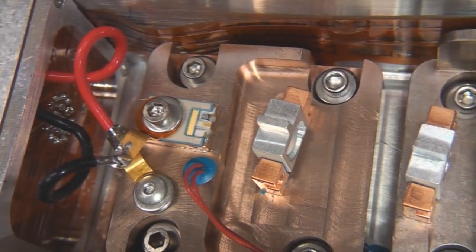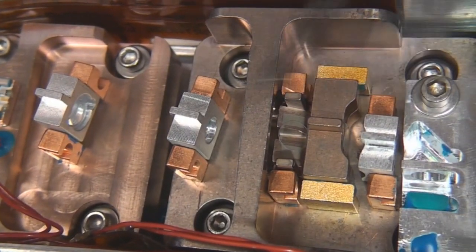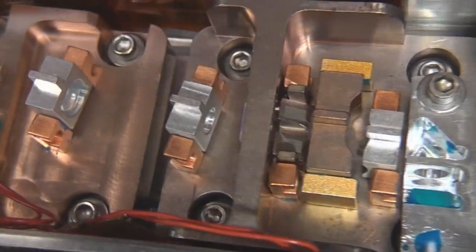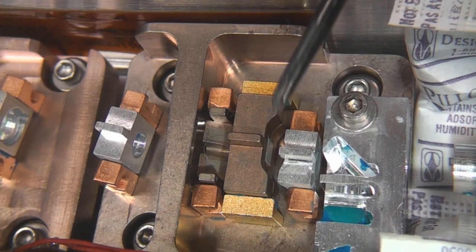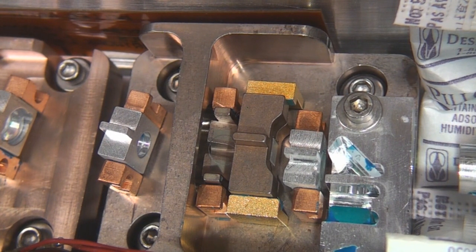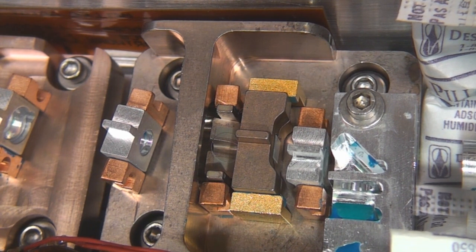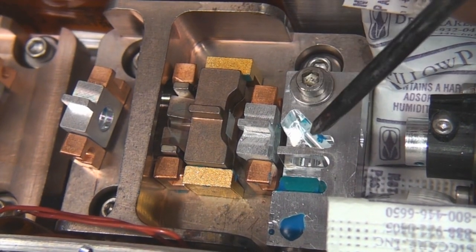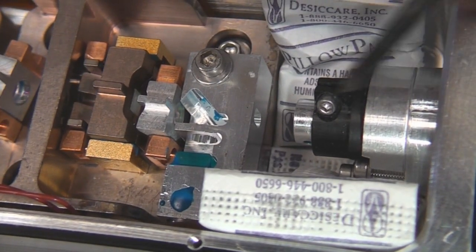And that goes through one bit of optics there and another one. And I think this central section is probably the main cavity. There's a crystal in there of some sort. I don't really know too much of the details, but the general idea is you've got a main lasing cavity and a frequency doubling crystal using all sorts of weird funky optics to double the frequency. So this is probably about 1120 nanometers, frequency doubled to 561. And then this goes through an angled beam splitter here down to a monitoring photodiode to measure the output, and then that goes out to the output here.